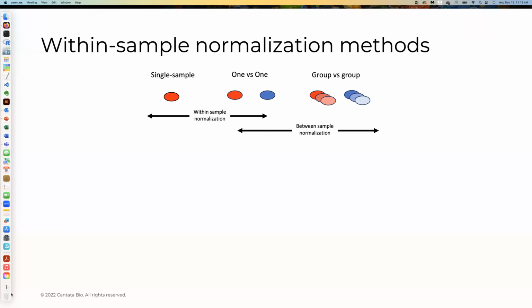Perfect. So I think what we'd like to do with the rest of this webinar is a couple of things. One, a brief review of some of the normalization methods that exist, what their uses and potential limitations are, and, depending on your experiment, which one you might choose. Also, hopefully simplify that decision-making process. I know there's a lot of tools out there. You see a lot of different methods. At the end of the day, we'd like to simplify that process and hopefully help that decision.